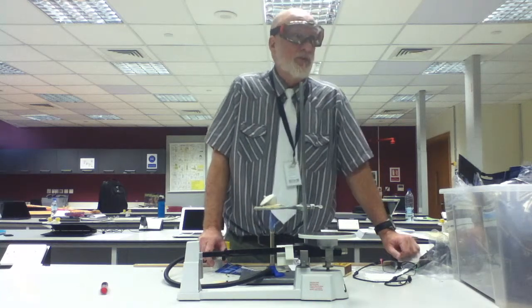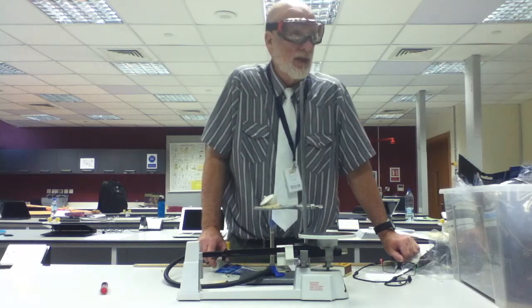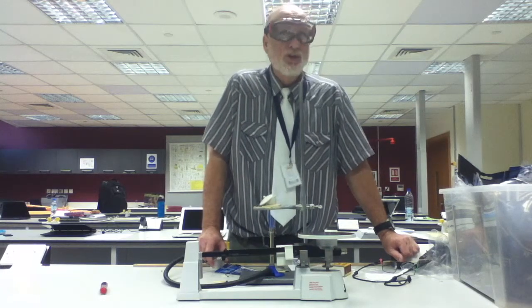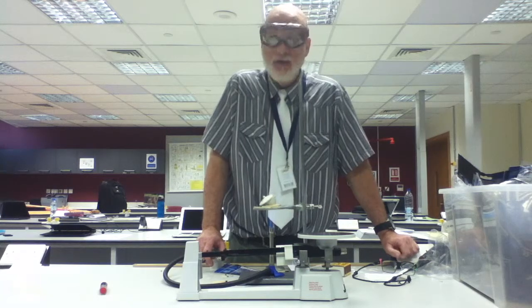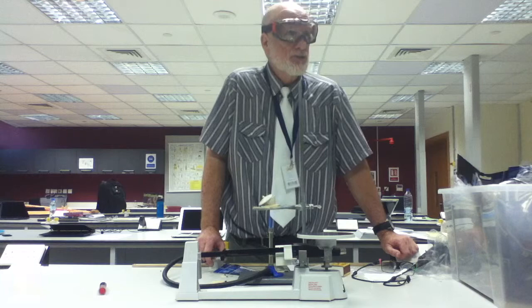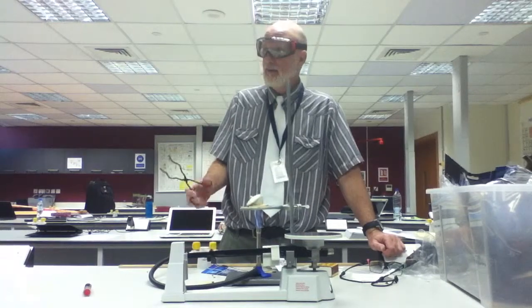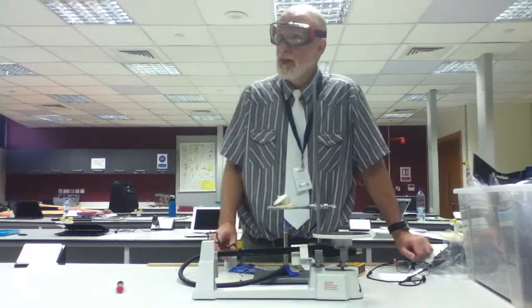The lid and crucible. The mass, let's say it as if we know English really well, and I know you do. You would subtract from the mass of the crucible, lid, and magnesium oxide, you would subtract from that the mass of the lid and crucible. Is that correct? Excellent. You get it? Michael, thank you for participating. I appreciate that.